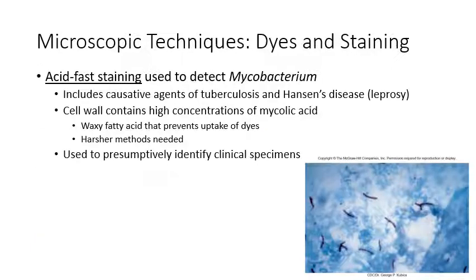All right, acid-fast staining. This one is good for staining bacteria that don't pick up a gram stain as well. So these ones are typically a little bit harder to stain. So things like Mycobacterium leprae, which causes leprosy. It's got this kind of waxy coat on the outside that makes it difficult to pick up stains, but an acid-fast stain will work for staining Mycobacterium leprae.